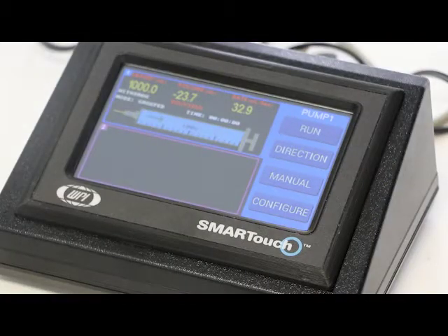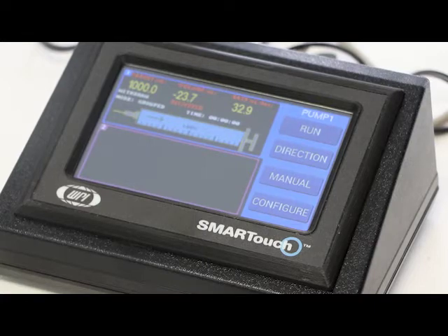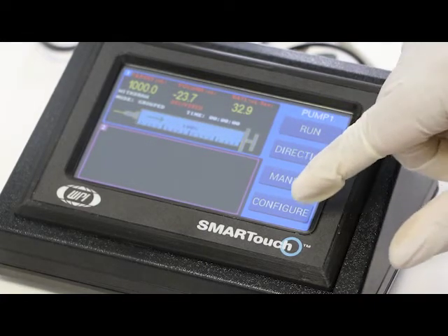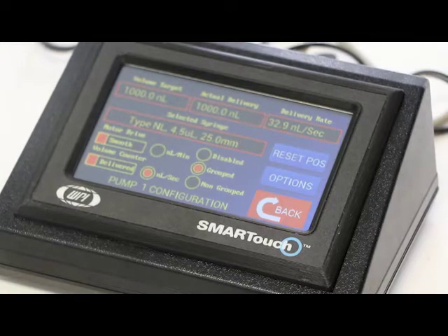We're going to show you how to set the home position of the plunger on the injector nano-liter 2020. First thing we do is hit the configure screen, configure button. We hit the reset position.